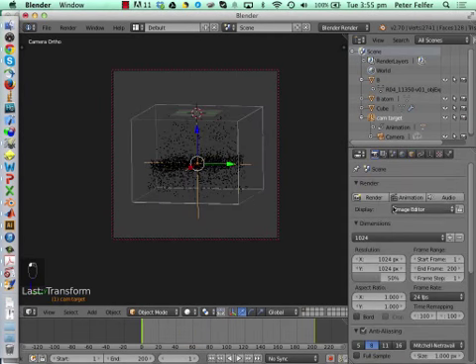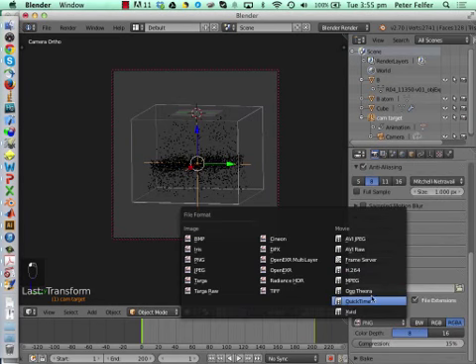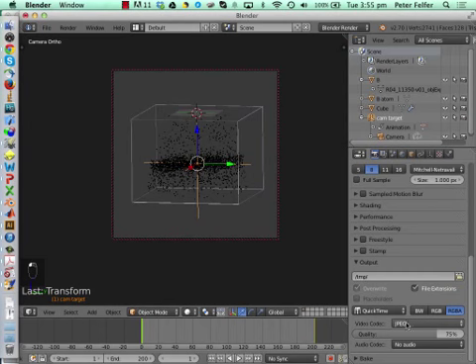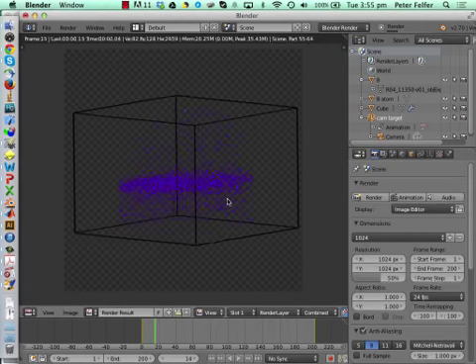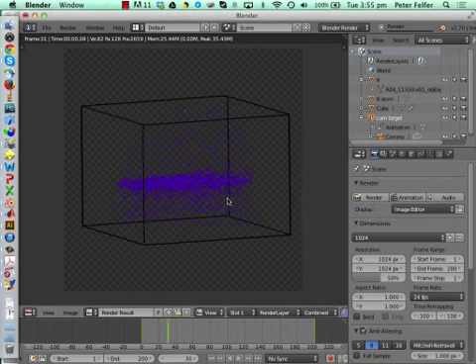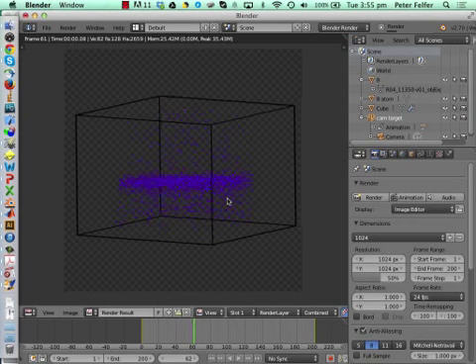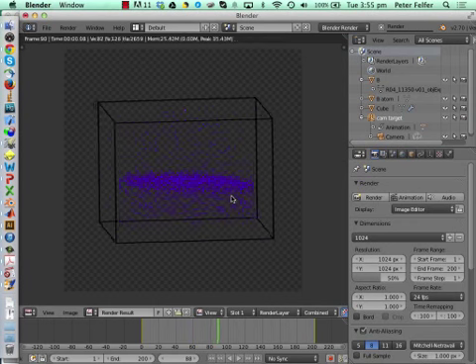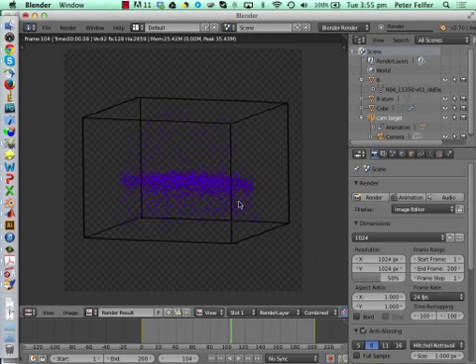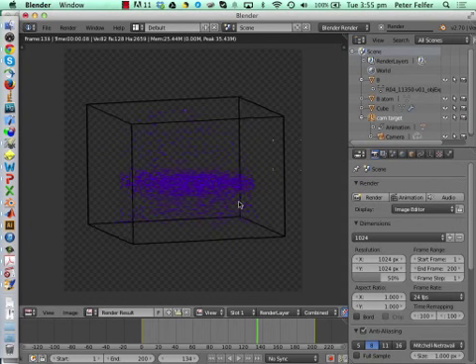In terms of render times, we'll just set it to QuickTime with JPEG encoding, and you'll see that if we do it with the halo material that I showed you before, it actually renders at a reasonably quick pace as well. What's all that orange stuff? The orange stuff is the actual render tiles. So each thread on your computer renders one tile.